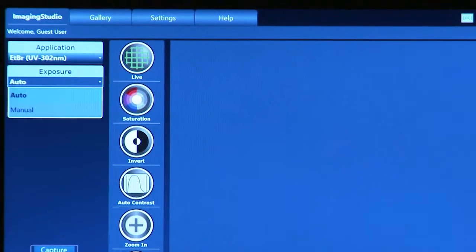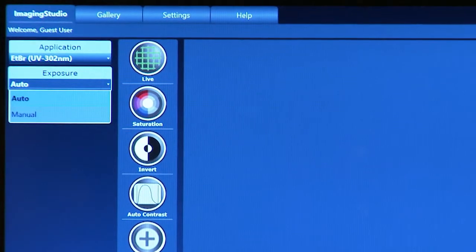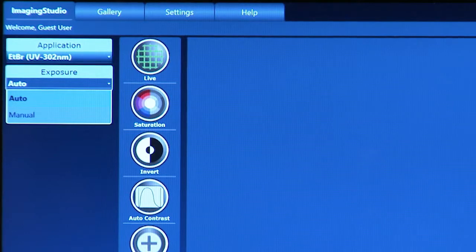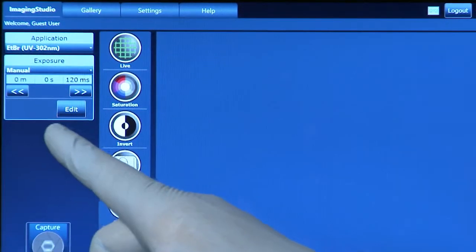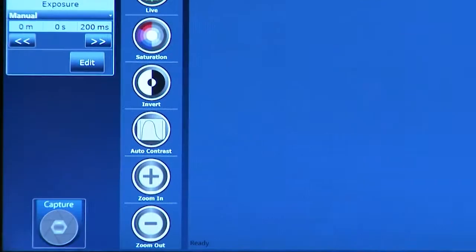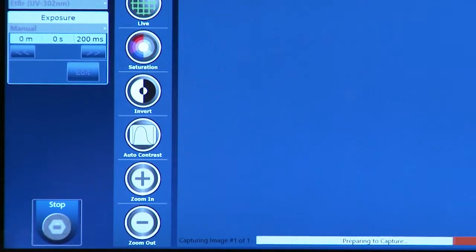Gel imaging applications have 2 exposure methods, auto and manual. Auto automatically determines the exposure time, ensuring there is no saturation in the image. Manual allows you to enter your own exposure time. Most gels image just fine with the auto method, so all I'll need to do is select capture and wait for my gel to appear on the screen.